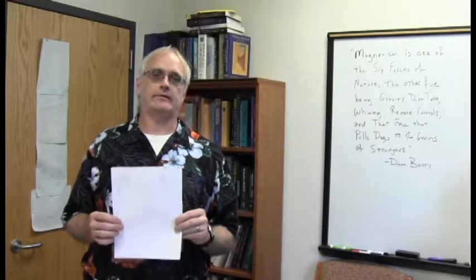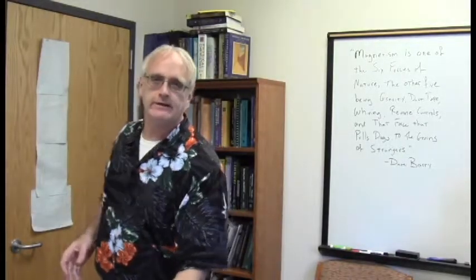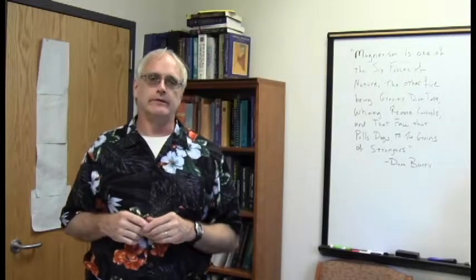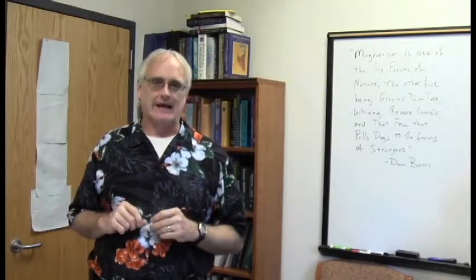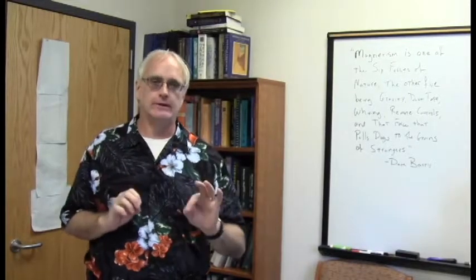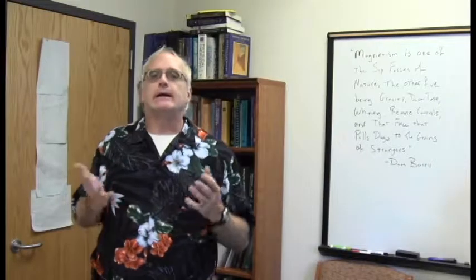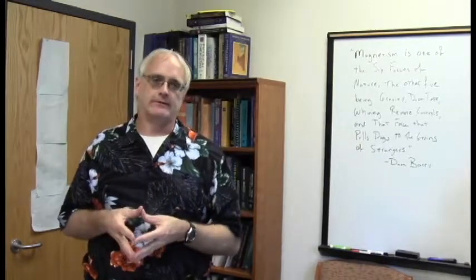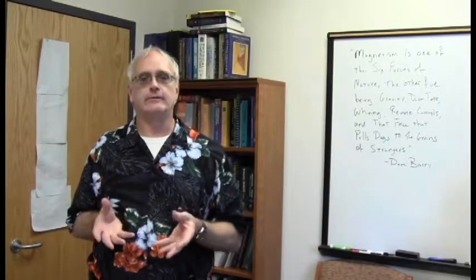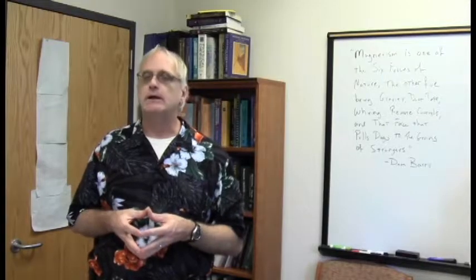There, that gets us our nice pretty spectrum. But the problem with it is it took us a fair amount of time. And let's face it, if I wanted to do this more finely, I would have taken more time. I would have turned the dial much more slowly and gotten my drawings much more accurately done. Doing a continuous wave spectrum this way takes a considerable amount of time, and the greater resolution you want, the more time it's going to take.